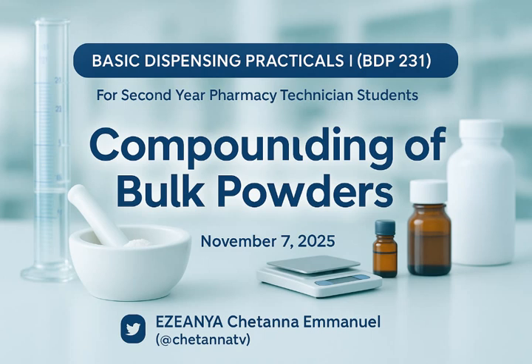So now, this is a master formula. This one is just the formula we are going to use to produce, but it's not a formula that should be on the label because it's not the actual quantity. But if you mix well, once you take 50 grams from here, it must contain 12.5 grams of this, 12.5 grams of this, and how many grams of this? 25 grams, right?